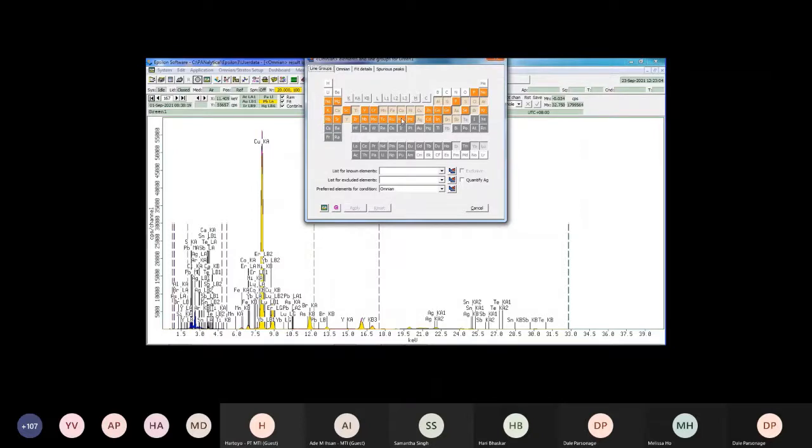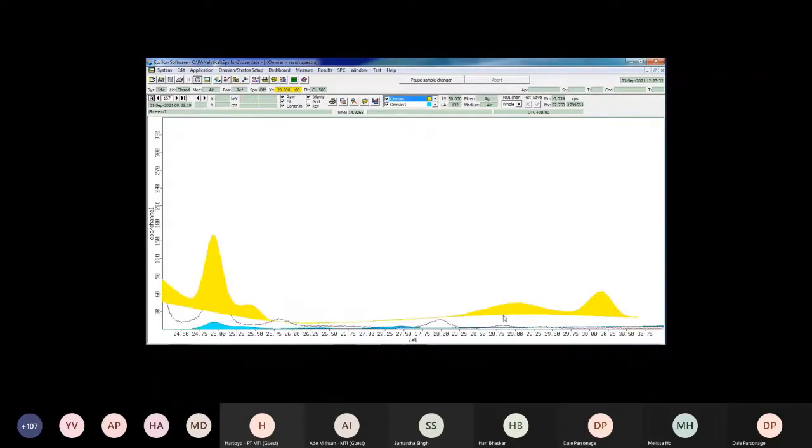You can turn elements on and off, because with EDXRF, it's a fundamental method: when you have both alpha energies and beta energies present, it identifies the material. So you can really scrutinize the periodic table and see whether the Omnian has given an accurate result, and also look for unresolved peaks and have additional information added.